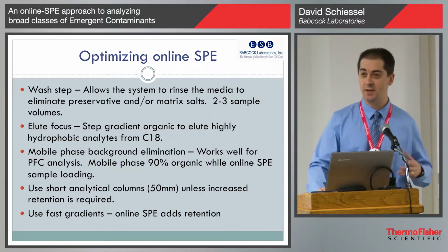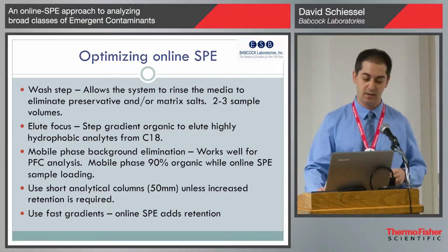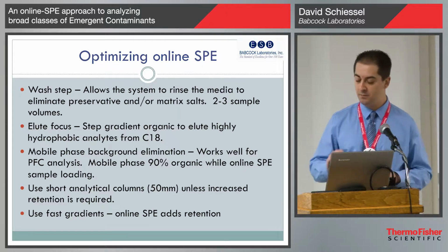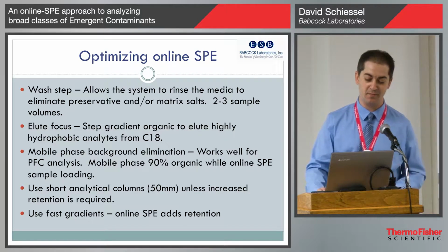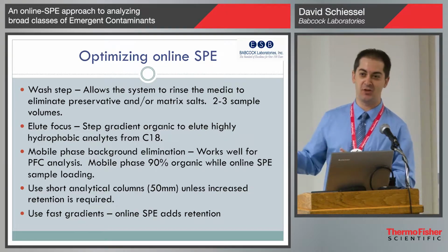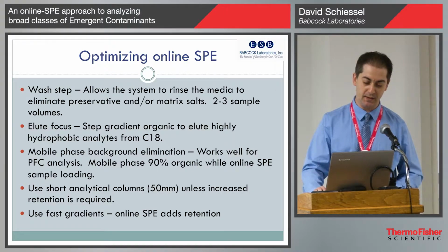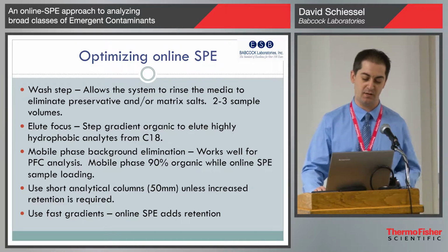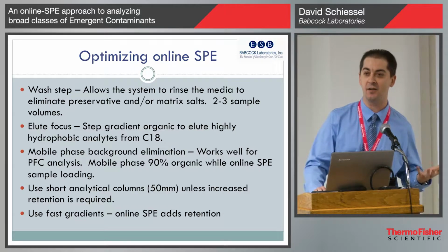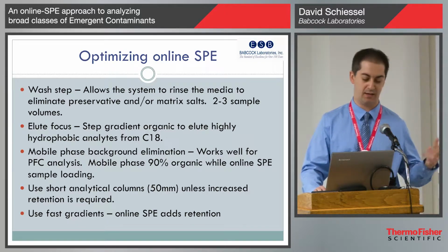Of course, with PFC analysis, there are issues with background contamination, and I've spent weeks on this trying to figure out where it actually comes from, because I didn't just want to change out everything with a kit. It seems like it's coming from, I think one person mentioned the degasser, which I hadn't thought of. And so we've tried changing out lines and things like that.